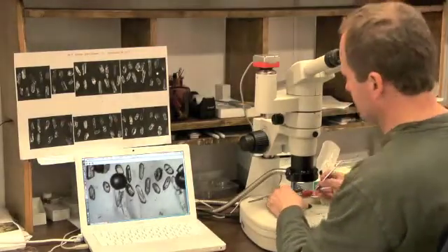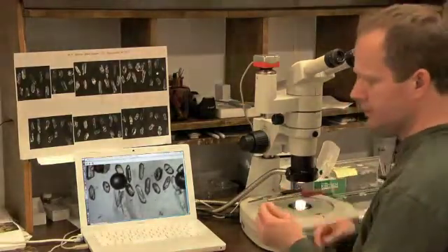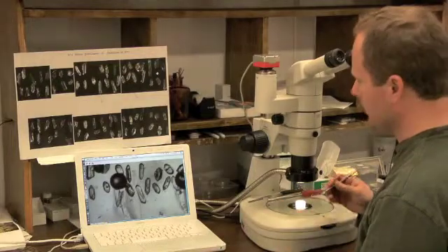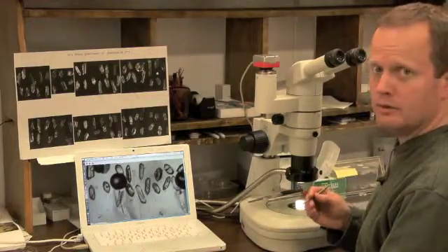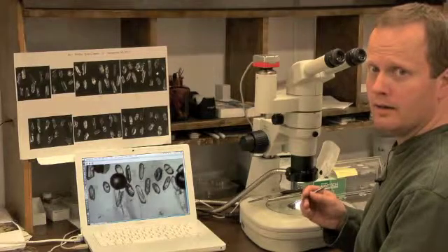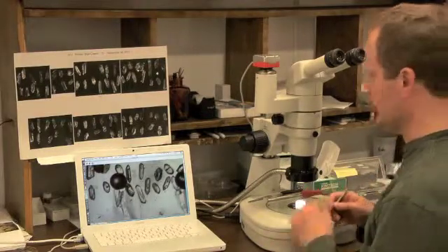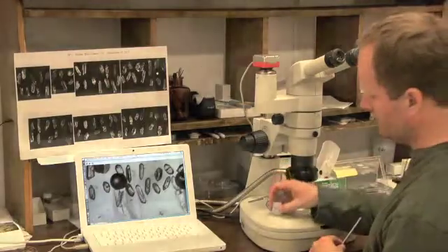To extract the zircon, I'm going to use this dental pick to place pressure on the epoxy mount, lever the crystal out of the plastic, and then use the tweezers to transfer it into one of these teflon beakers.